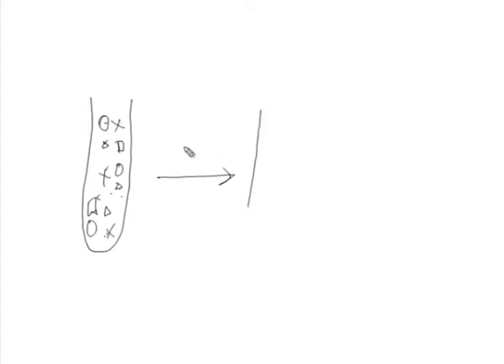So, you will get a pellet here, formed according to the kind of rotor you are using. The pellet will contain, say, the biggest molecules. Now, the problem is why you get partial purity, and you will also get these other things, which are again distributed all over.